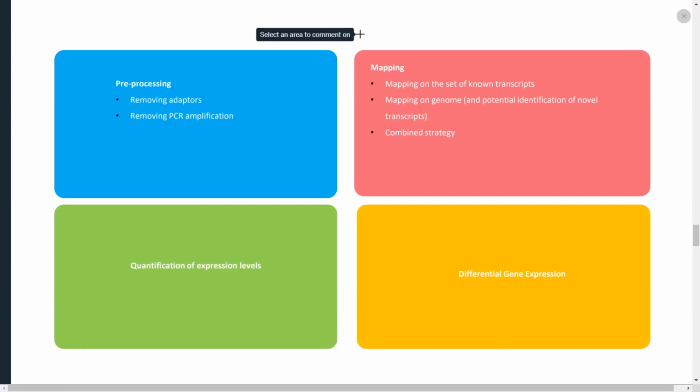The next function which an RNA-seq pipeline does is mapping. Mapping against two things. One is a reference genome and another one is mapping against the transcriptome. So we have different algorithms, namely Bowtie2G, TopHat or HISAT2 for mapping against the genome and Bowtie2T for mapping against the transcriptome. The other algorithm which follows all these mapping algorithms is known as RSEM table expression, or which is otherwise known as quantification or abundance table production.